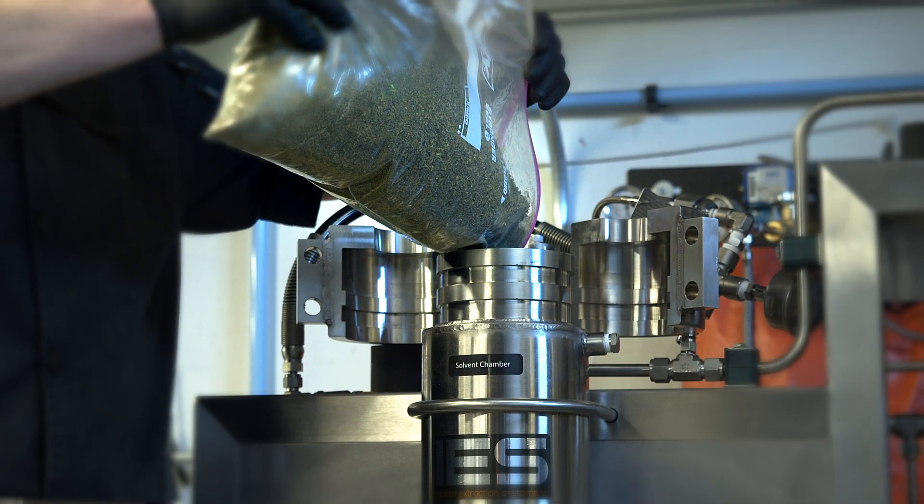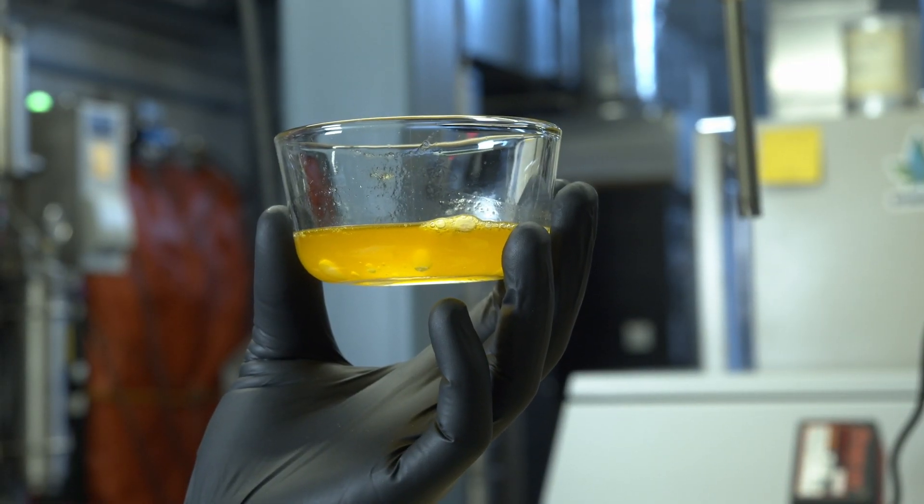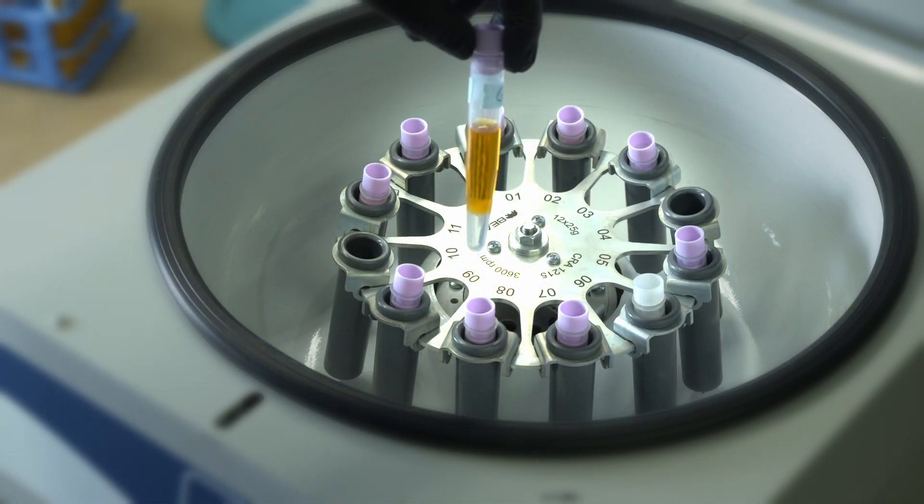After the material is nice and ground, we load it into our extractor and then we pull out our terpenes. We do preserve that full terpene profile — not just the mono and sesquiterpenes, but di, tri, and flavonoids as well.